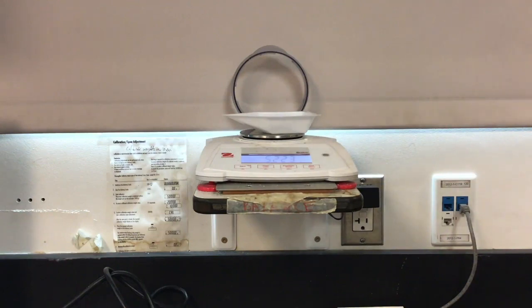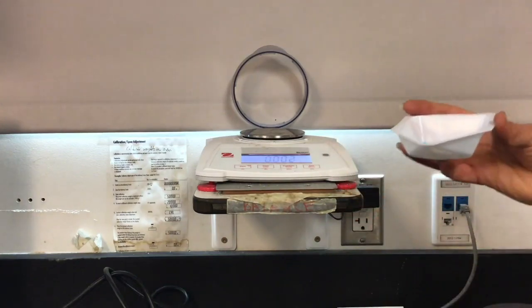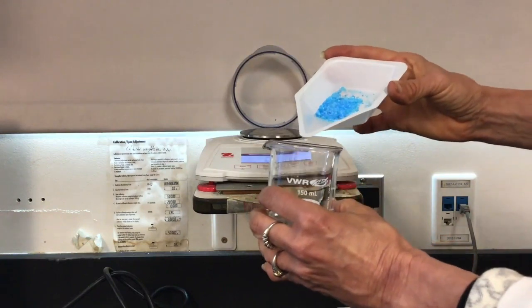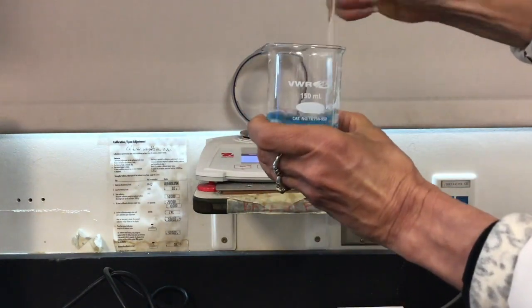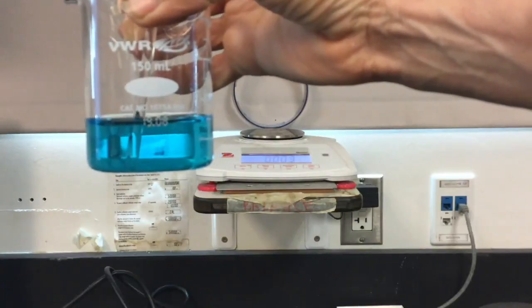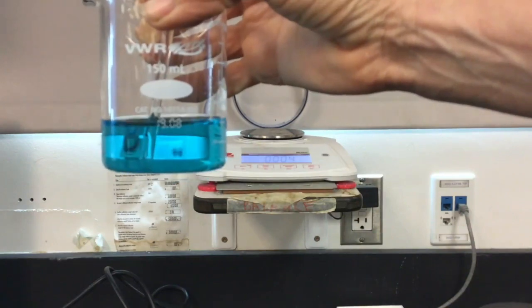So we have 5.223 grams of copper sulfate plus the weighing boat. So again, you would subtract the mass of the empty weighing boat to get the mass of our copper sulfate pentahydrate. Now we're going to make our solution. So we have our water measured out. We know the mass of that. And then we're going to add our copper sulfate pentahydrate to our water. Now we have, after mixing, an aqueous solution of copper sulfate pentahydrate. Once our solution is completely dissolved, now we can go ahead and calculate the mass percent of copper sulfate pentahydrate that is in our aqueous solution.